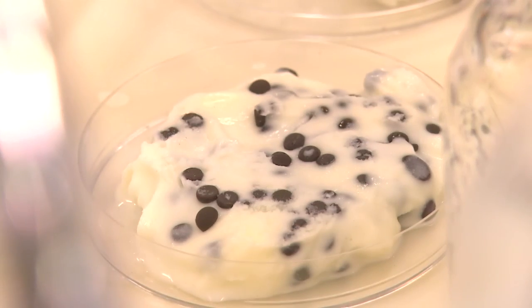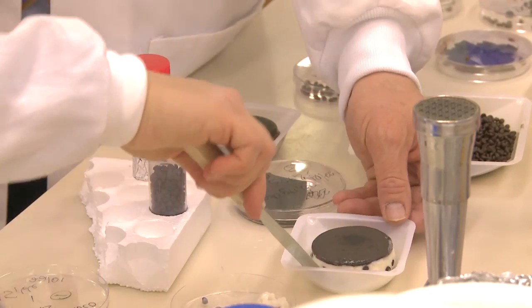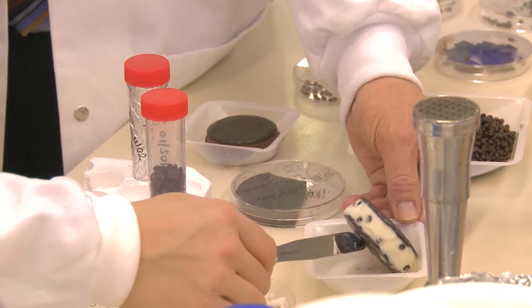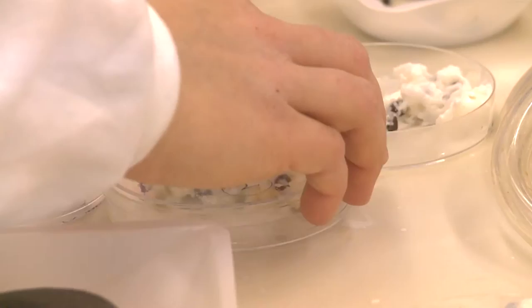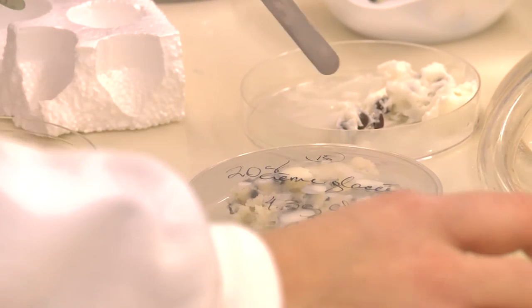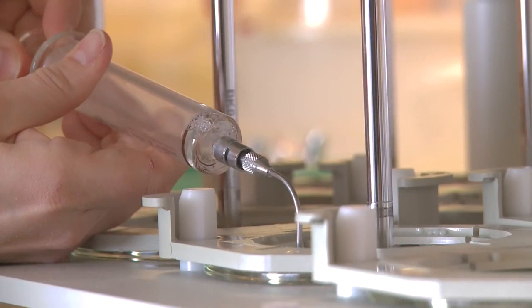Probiotic bacteria are living organisms. Our challenge, therefore, is to keep these bacteria alive. We have developed micro-encapsulation techniques such as gel beads or systems that specifically coat cultures. And with these micro-encapsulation techniques, we can separate the bacteria from the food matrix and sometimes increase their survival.